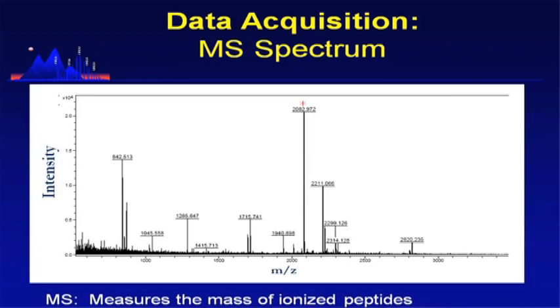This is one thing I'm not going to go into in this lecture, but I think later Nicole gives you a lecture on quantitative analysis by mass spectrometry. What I'll say is that mass spectrometry is not a quantitative technique, because the height of this peak is based on how many ions we detect. But how many ions we detect is based on both how much is there and also the ionization efficiency of that particular molecule. How well does it take on a charge?